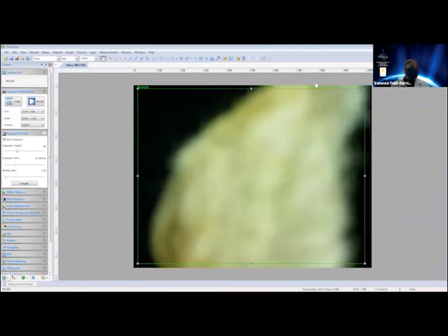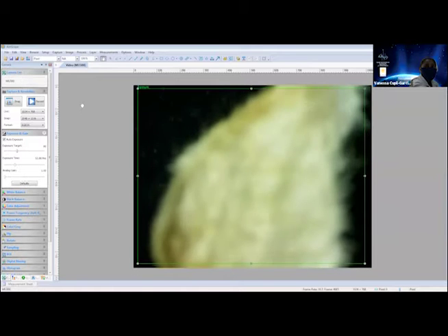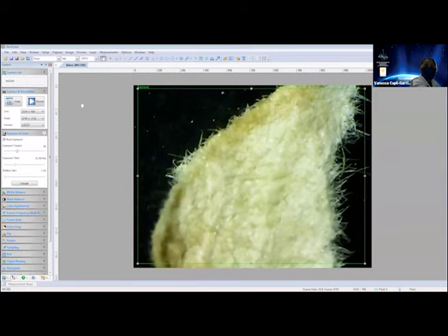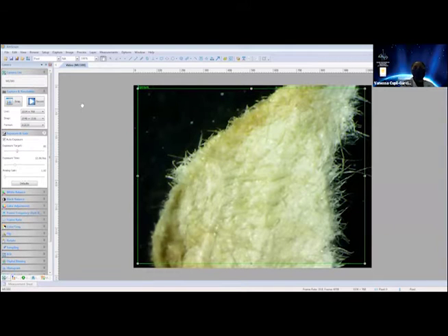So now we're going to analyze our three samples using the light microscope. This software here is showing you the light microscope. It has a camera on one of the eyepieces of the microscope. So we're looking at the piece of paper from an old book. And right now we're out of focus. So if I move the objective by turning a knob, here we can see the paper much more defined. And we can see some of the fibers that the paper is made out of. But of course we can't get down to the smaller structures.